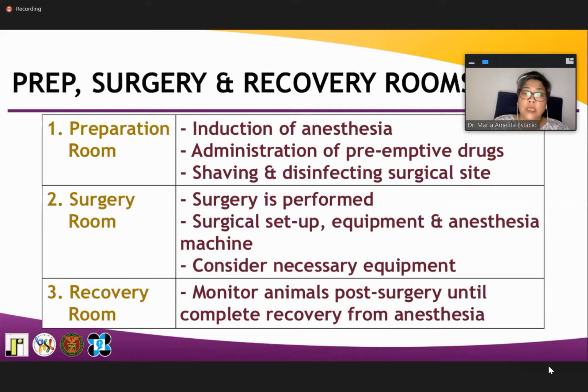And of course, you need to consider other equipment that would be needed. So there are portable, say, digital x-rays, ultrasounds, or other equipment that is needed depending on the type of surgery that you would use.